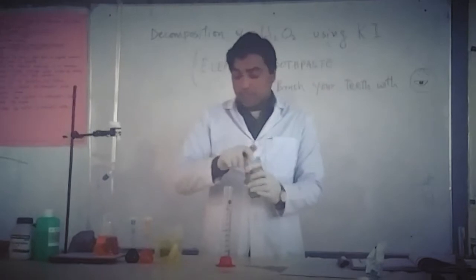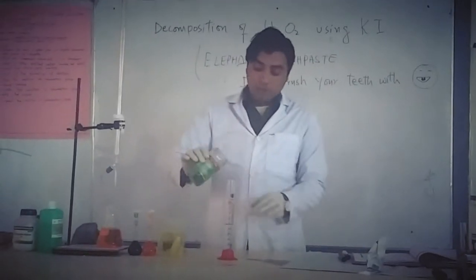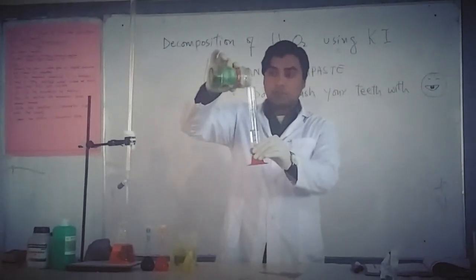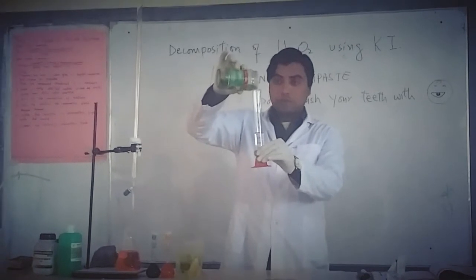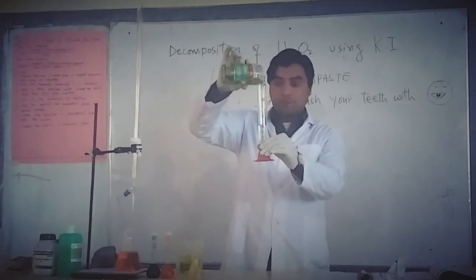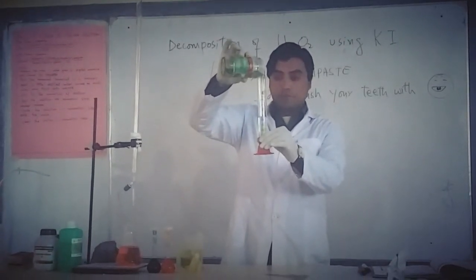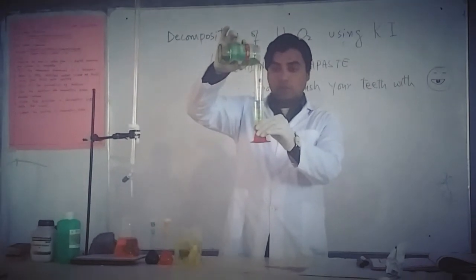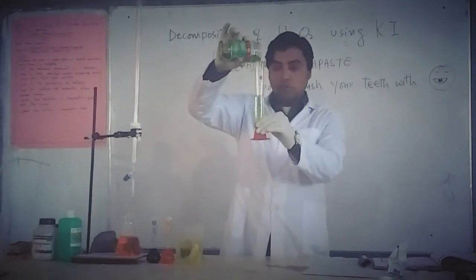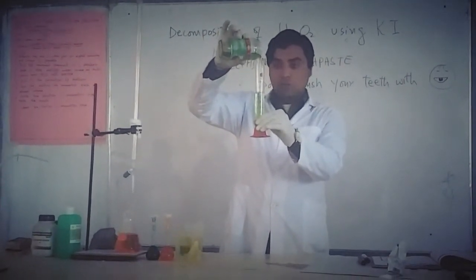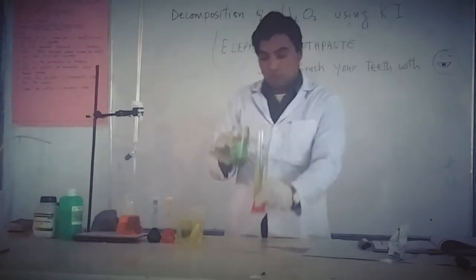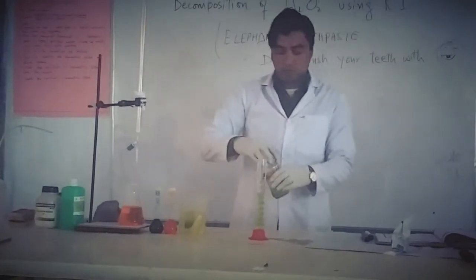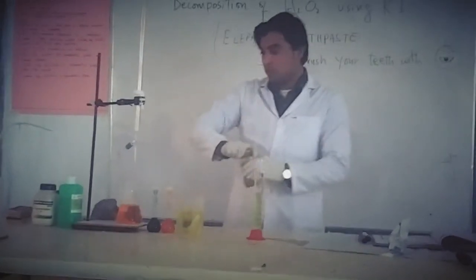We have to add the catalyst. The catalyst is used to speed up the reaction. We will use 20 ml of hydrogen peroxide and proceed with the process.